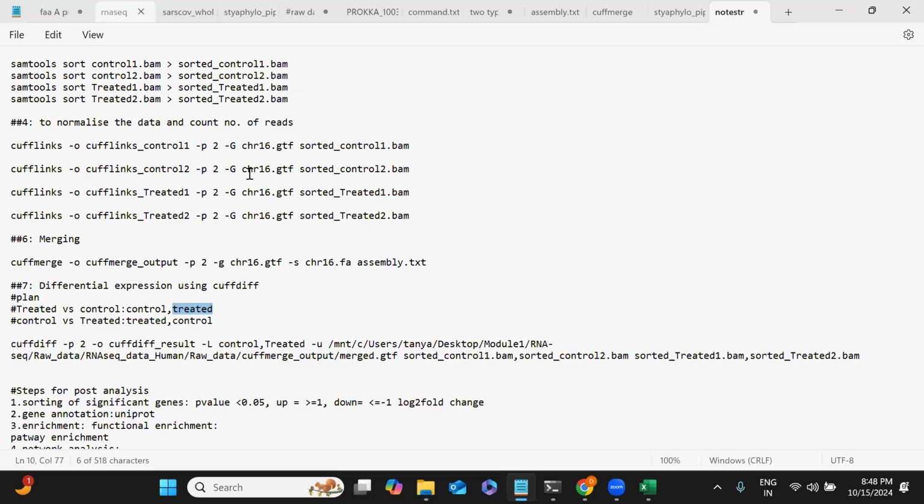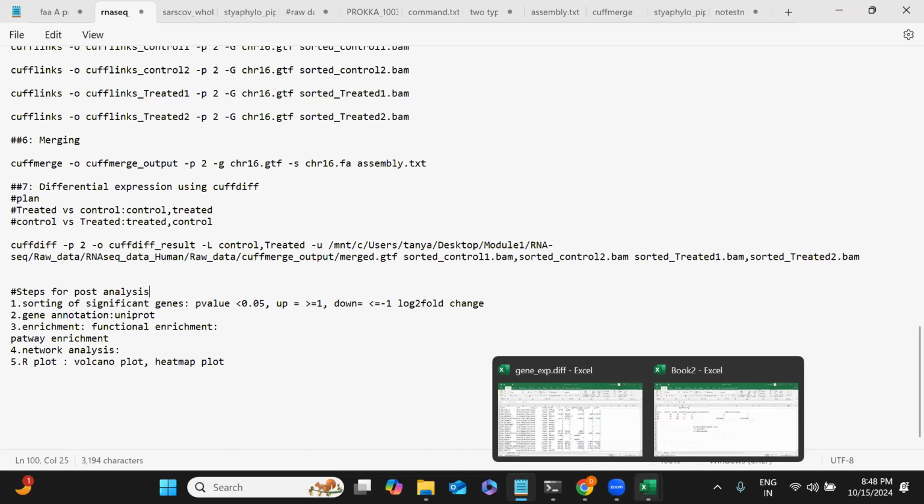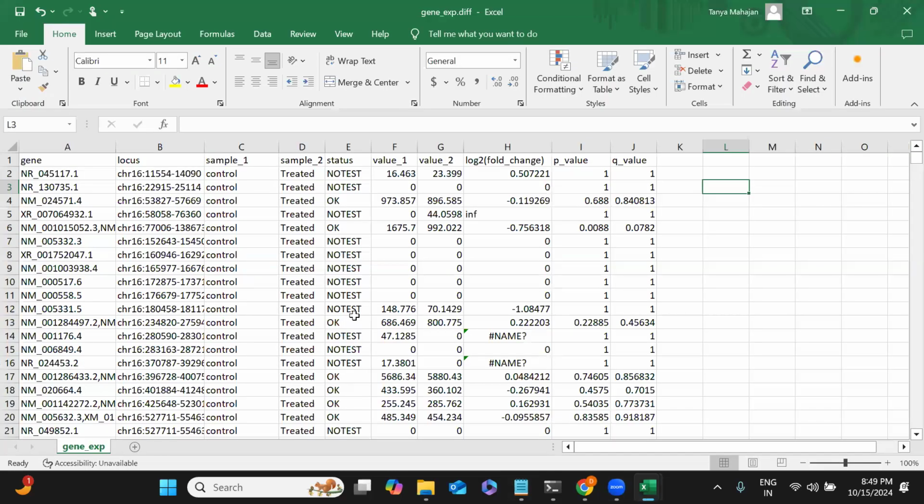I have a question. Jessel, yes, please. Based on this Excel data sheet, do you think there is still a need to control the quality of this data, or will everything be included in the analysis? No, sir, Jessel. We are going to apply the filter further. I was just explaining because people are very new to this analysis, so I have to discuss what this data is before putting the filter. We will discuss further. All right, thank you.